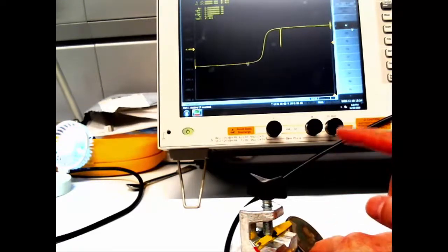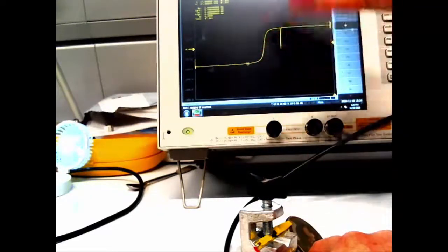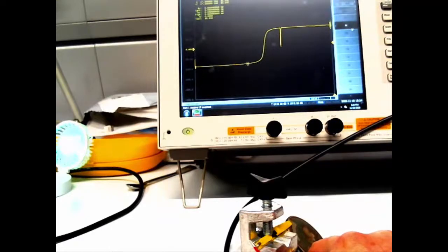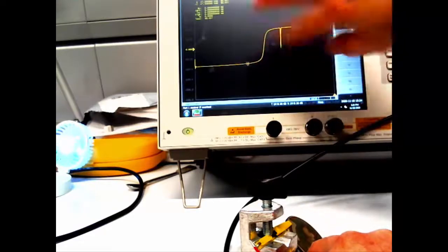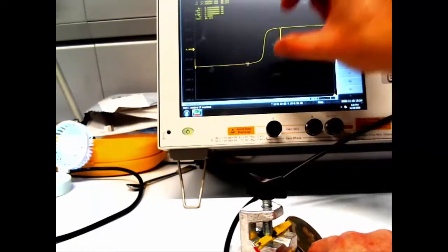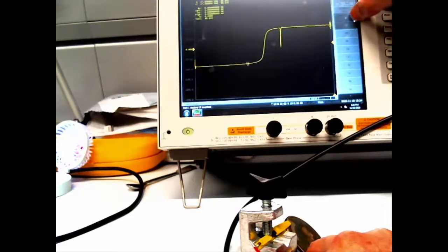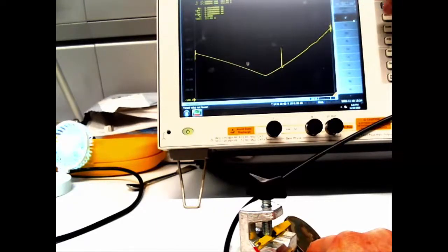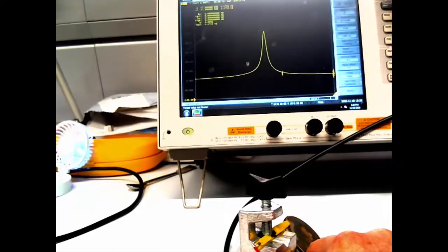So it has a large phase offset at the resonance, so it switches from behind to in front effectively. Because it's trying to go faster when it's too slow, and it's trying to go slower when it's too fast, so it shifts the phase offset. And it can only compensate to a certain amount, so only in this range can it force the circuit closer to what it wants to get to, but it can still delay it a certain amount or increase it a certain amount. So I'm wondering why that is so weird looking, but that one was better, with a nicer peak.